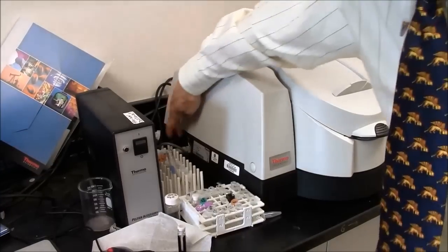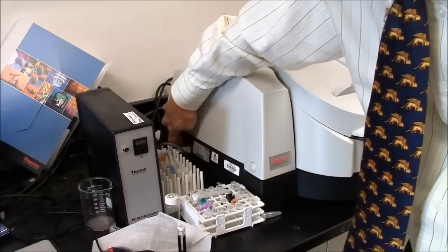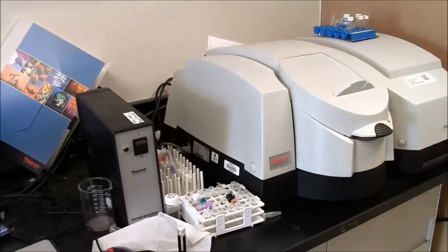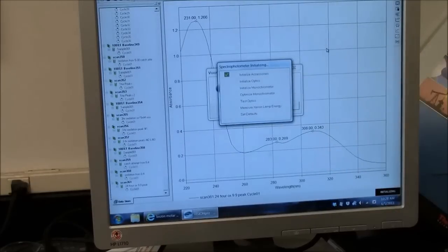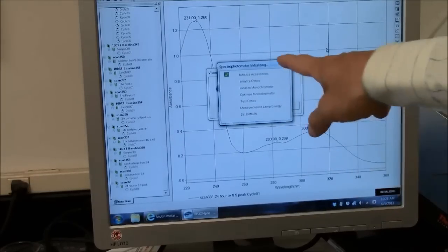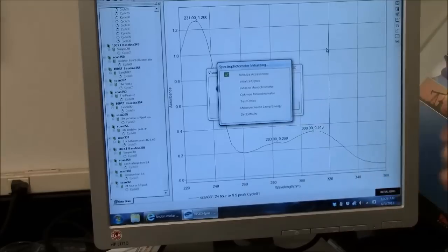First, turn the machine on. Power switch is here. When you turn on the spectrophotometer, it will go through a number of diagnostics.